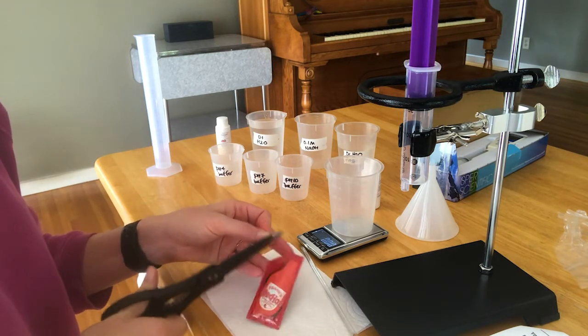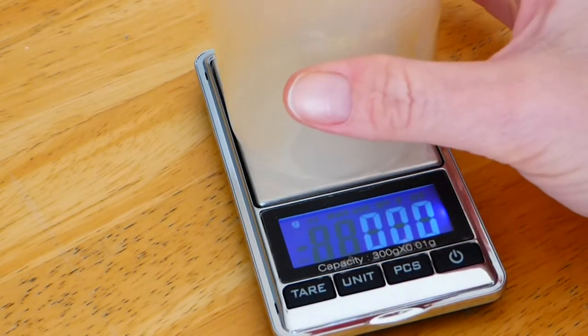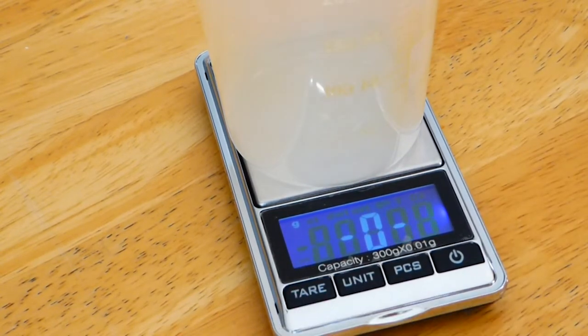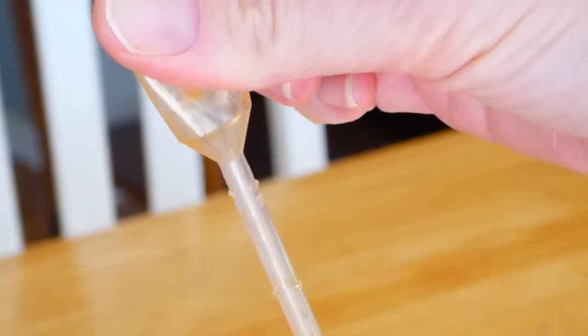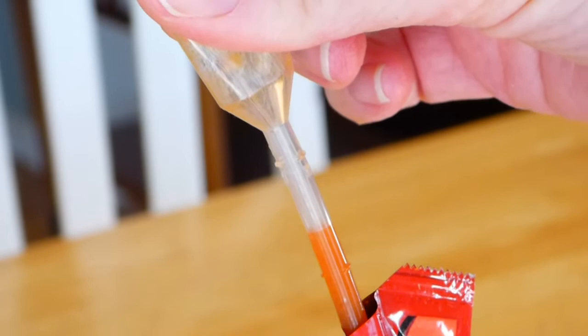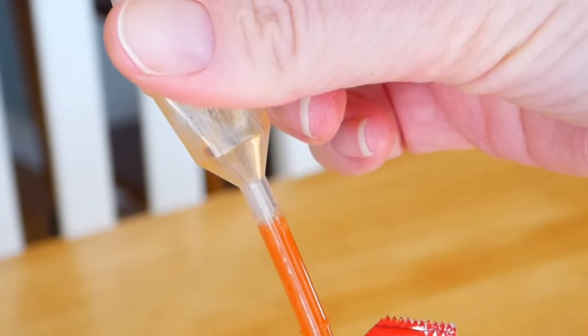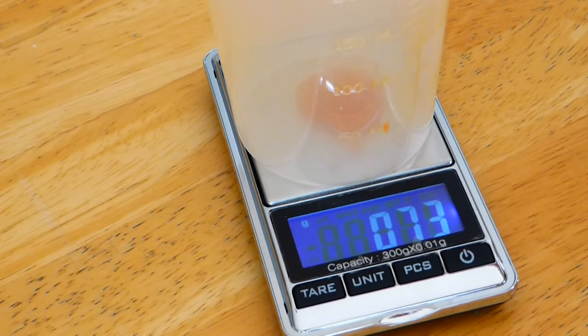Cut the corner off of your hot sauce packet. Get your balance ready and turn it on. Put your 250 milliliter beaker on the balance and press tare — that will zero it. Then put a pipette into the hot sauce, squeeze it first just like a regular pipette, and suck up the hot sauce to the top mark on the skinny part of this pipette. It doesn't have to be exact because we're going to weigh it. Then squirt out as much as you can into the beaker and record the mass — make sure you record all the digits.